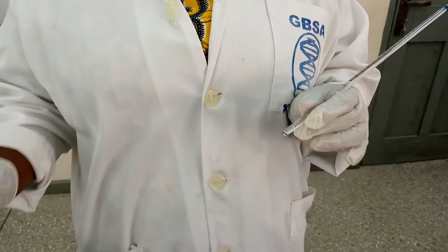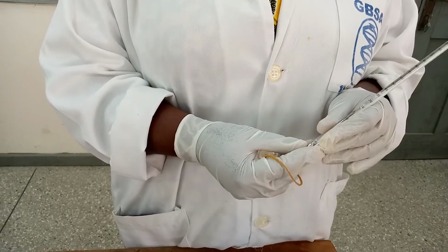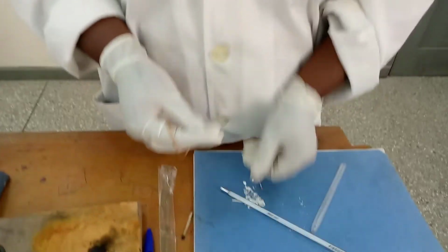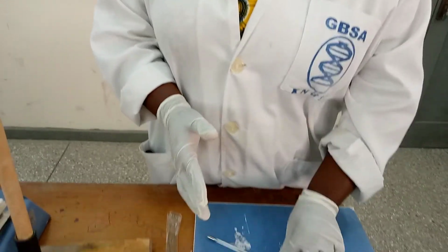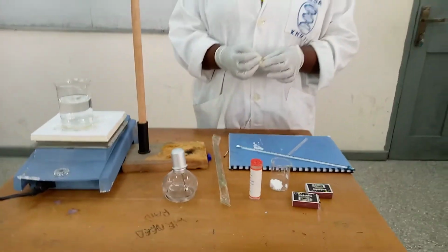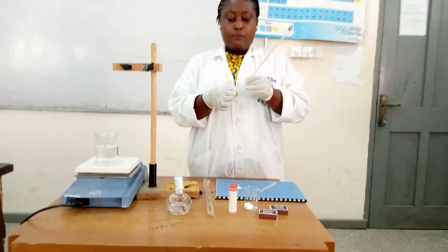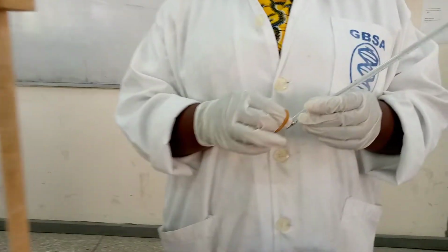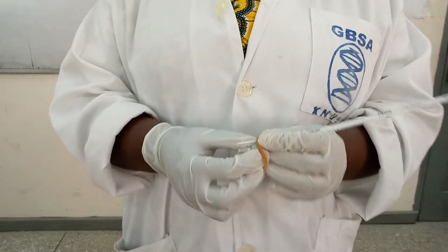Then I'll dip it in the paraffin oil. So I will need a rubber band. So I'm going to tie both of them together. So the rubber band, you have to fold it about 2 or 3 times. So I'm going to tie the two together.